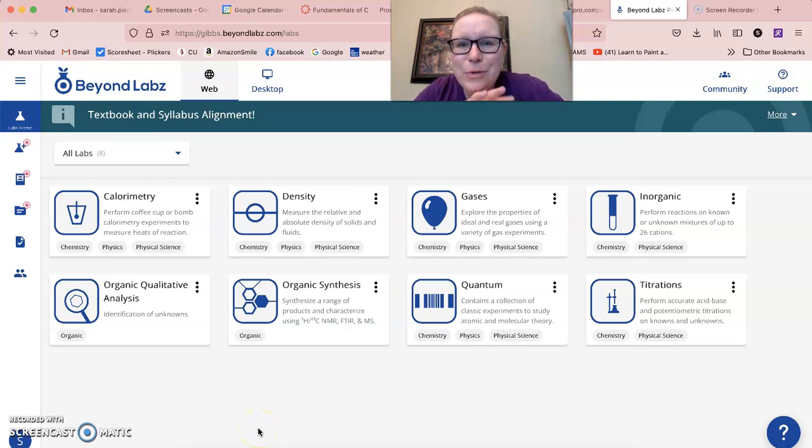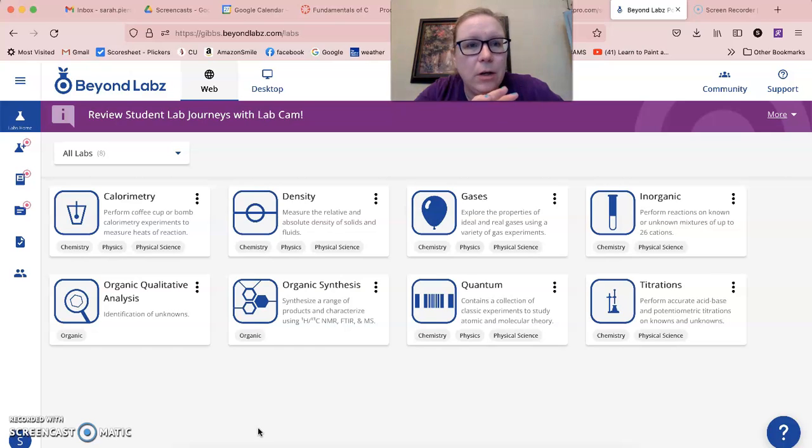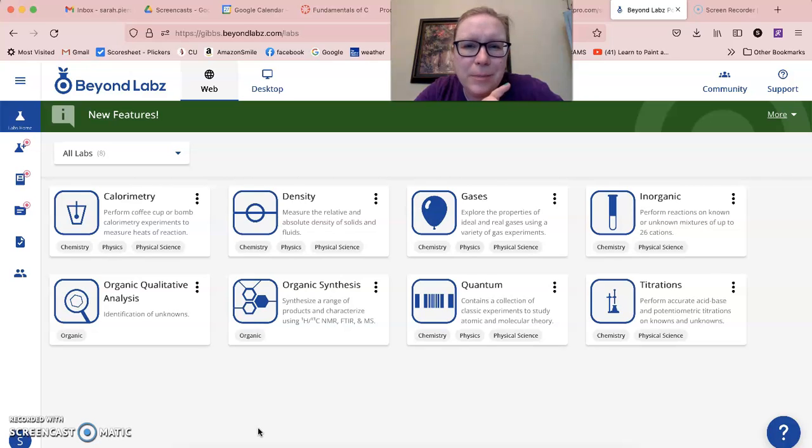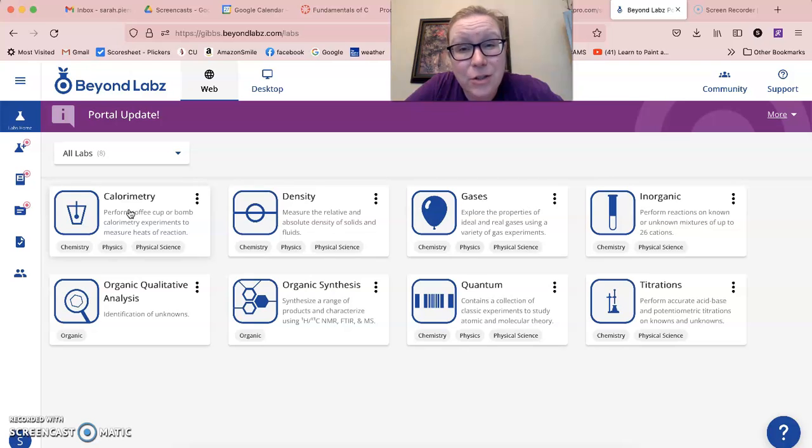Hi, if you are doing the enthalpy lab for Beyond Labs through the internet portal, not through the one that you download, we need to do something that's a little different. So I wanted to do a quick screencast.